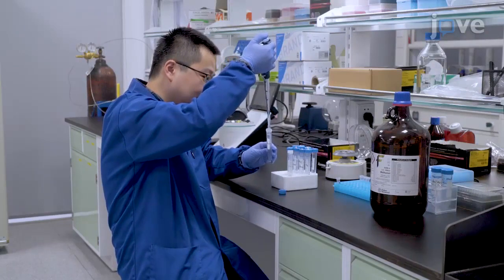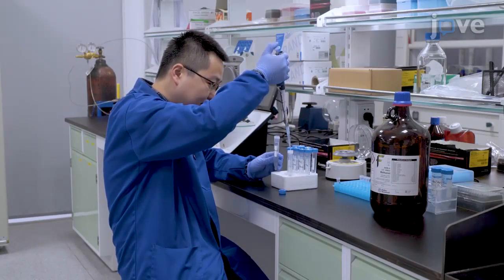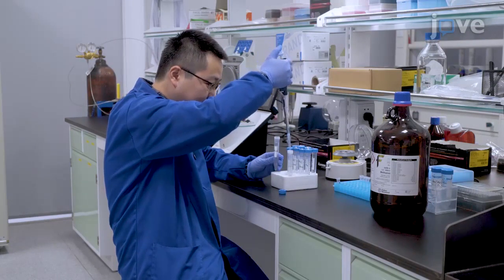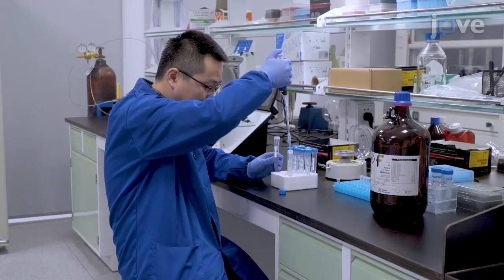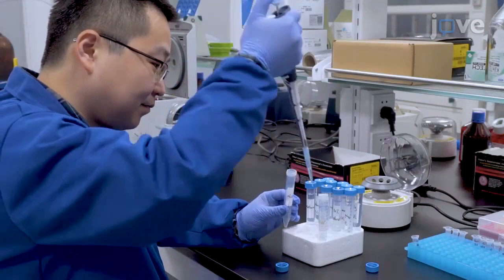For nitroangiotensin-2 desalting, use a 1 mL pipette to precondition a reverse-phase solid-phase extraction, or SPE, column with the addition of 500 µL of methanol and 500 µL of water into the top of the column.